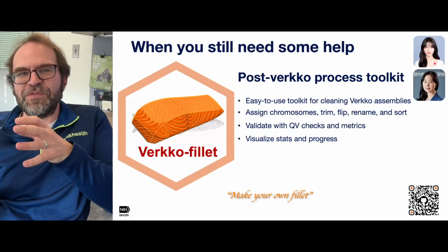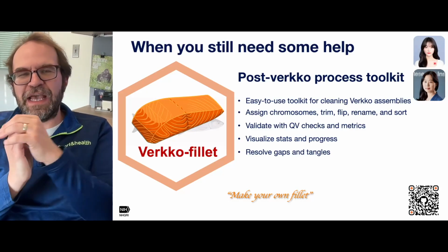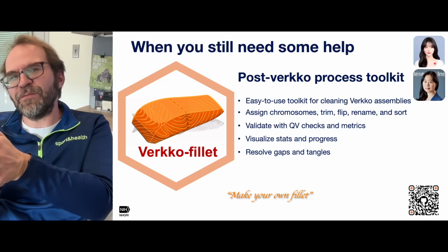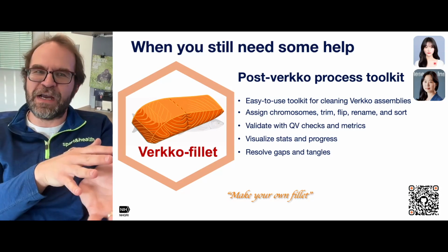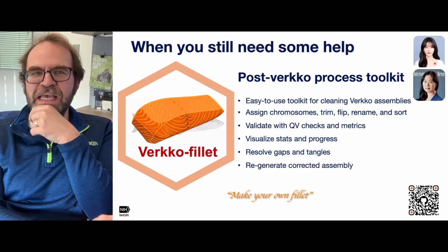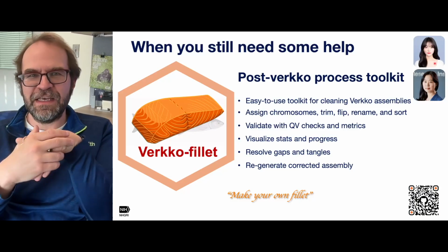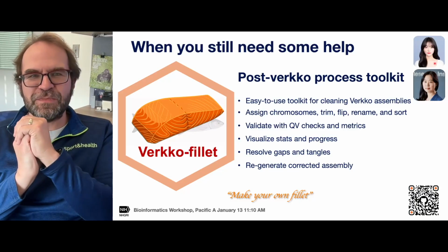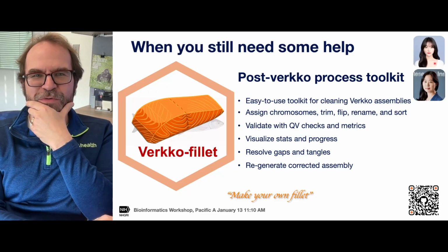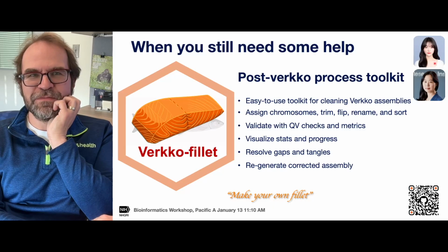As you make changes and improve the assembly, it'll keep updating that and show you now you're at 70%, and so on and so on. And it has kind of a tutorial and guidelines on what you can do about remaining gaps and how you can resolve them, whether that's using T2T for some of the more complex ones or using kind of manual curation for some of the other ones. And then it'll guide you and help you make a corrected assembly after you've made all these kind of edits. And again, Jian is going to present that on January 13th at 11:10 a.m. Again, if you want to hear more details about this tool and how she used it for a giraffe genome to resolve T2T assembly of the giraffe.